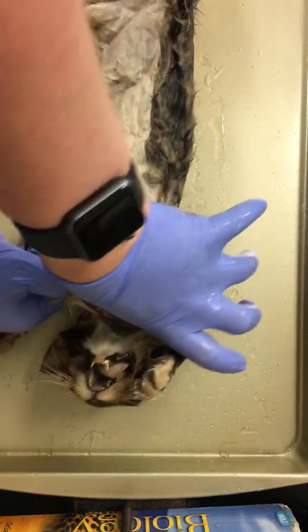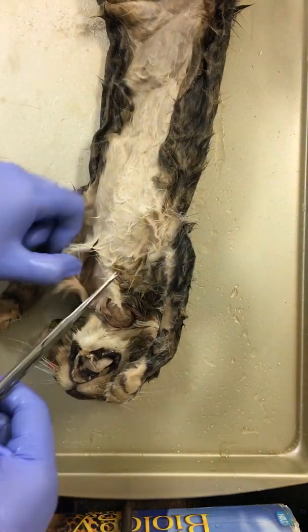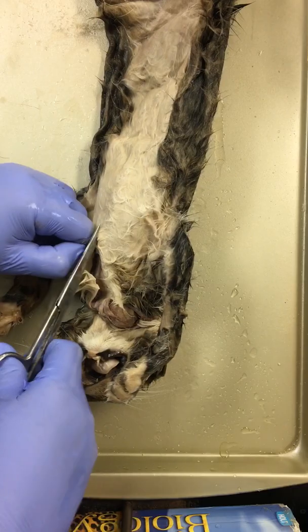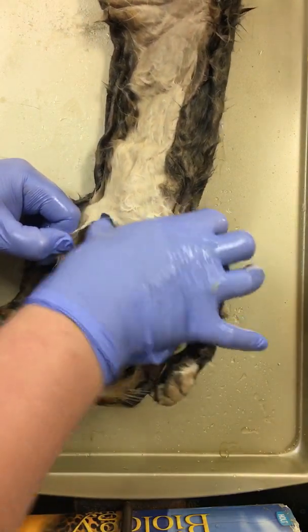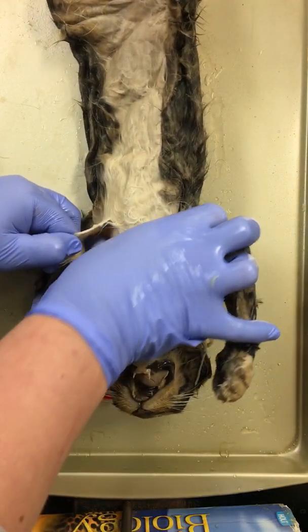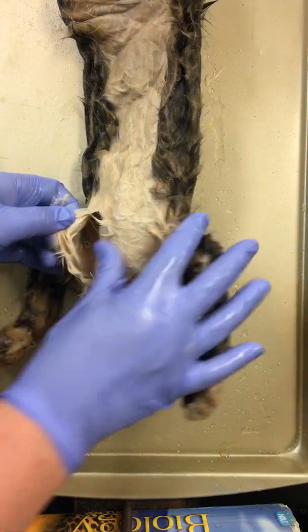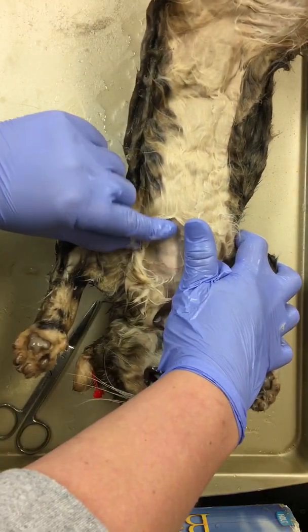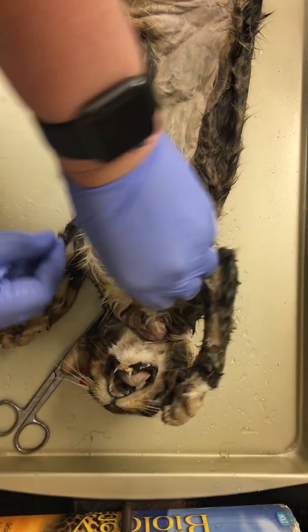You're going to see little string-like tendons start forming — those are nerves. We will also see a little red and blue; those are your veins and arteries. As we go down, we're starting to open this tissue up and expose it. You can see the nice exposure: our muscle, and then our skin, our integumentary.